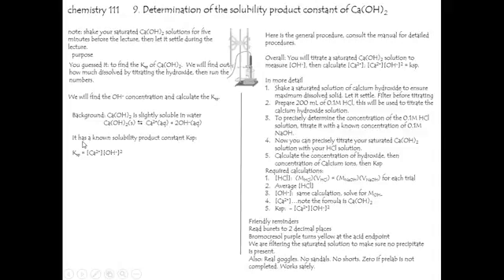And this is the solubility product constant that people use, and it's a known number for calcium hydroxide. It's simply, in solution at a given temperature, the amount of calcium ions in moles per liter, that's what those square brackets mean, and the concentration of hydroxide ions. Now this is squared. This is the way they've always dealt with this, so that coefficient becomes an exponent and we square it, and that's the KSP. You'll be graded on the precision of your number to the known value.